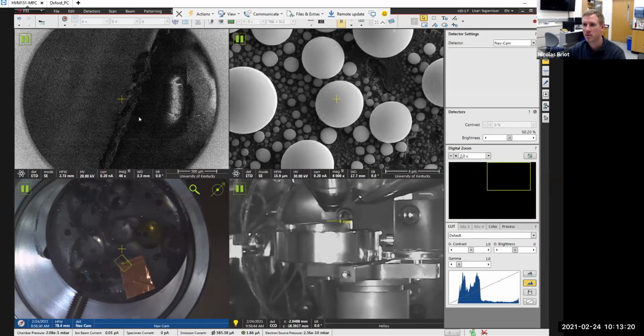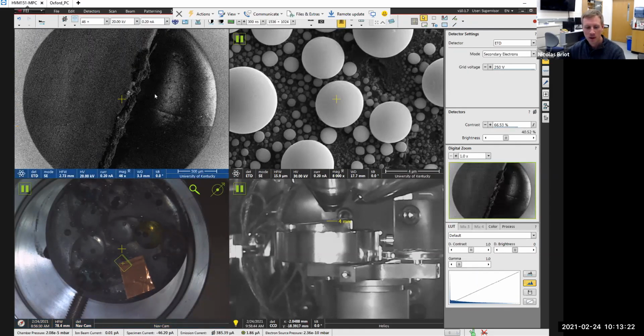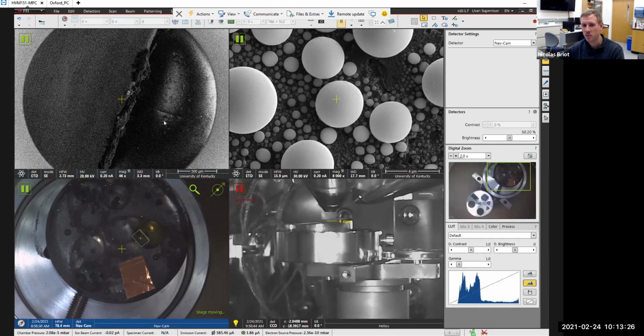So I pause the beam. I'm going to unpause it, and okay. So in that case, for example, it's a case where you kind of know what your sample is, right? I mean, it's glass, so you're going to have some silicon oxide, you know that, and you mentioned silver. What else are we expecting to see in there? And the question is for everybody, right? You should guide me. Those are your samples.